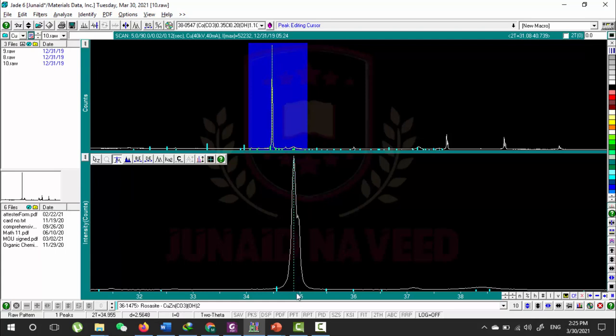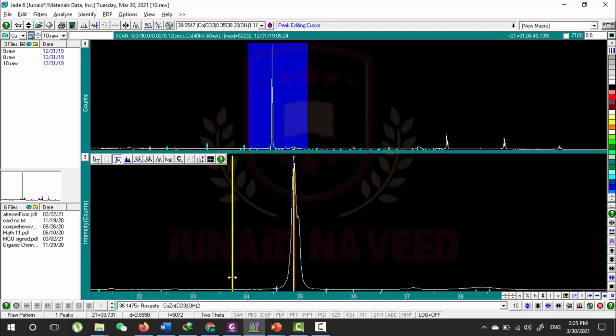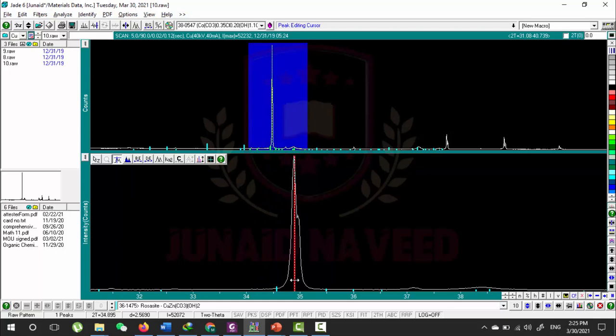I want to mark a peak on this point. You can see this dotted line is appearing here and you can see different values from here. If I bring my crosshair here on this and if I hold the Control key and move it, I can move it to any point. If I right-click on this thing, it will disappear.